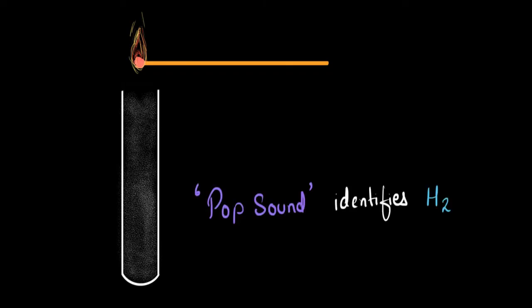Did you hear that? Listen to it again. So hydrogen gas burns over here with a pop sound, and this is unique to hydrogen. No other gas will burn giving a pop sound. So a pop sound identifies the presence of hydrogen gas. Now some of you might be wondering, Ram, why does hydrogen burn with a pop sound? Like what's special over here? Let me tell you a little bit in detail.